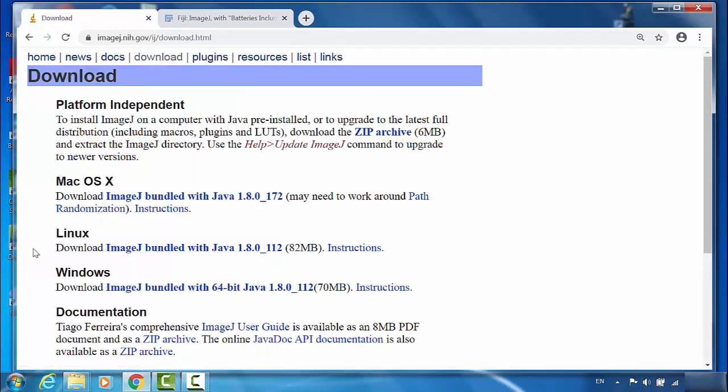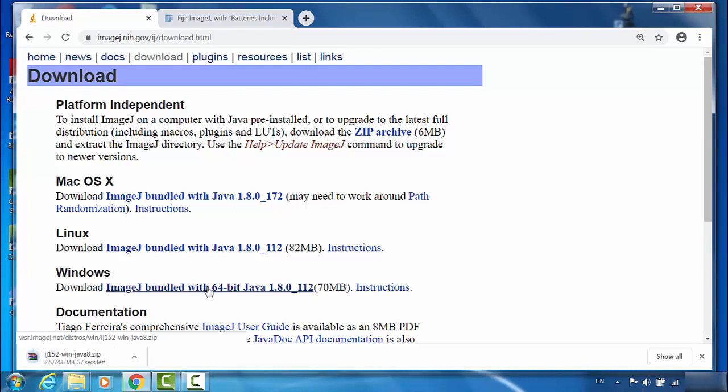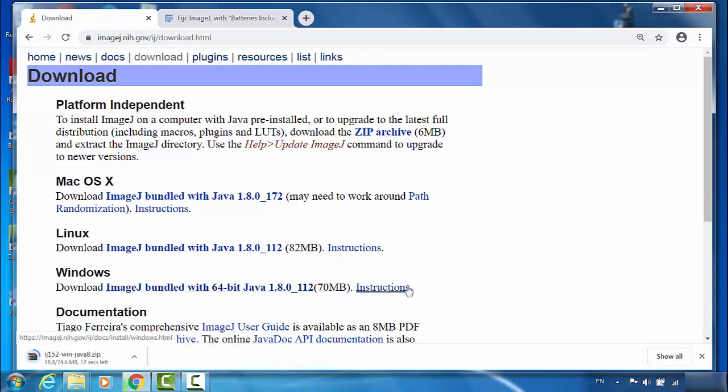Same as Fiji, you can choose your platform. I'm a PC guy. I'll go to Windows. You can also click on the instructions for detailed information.